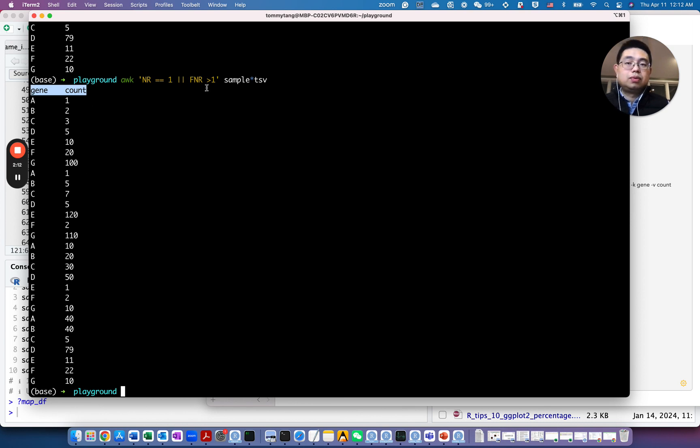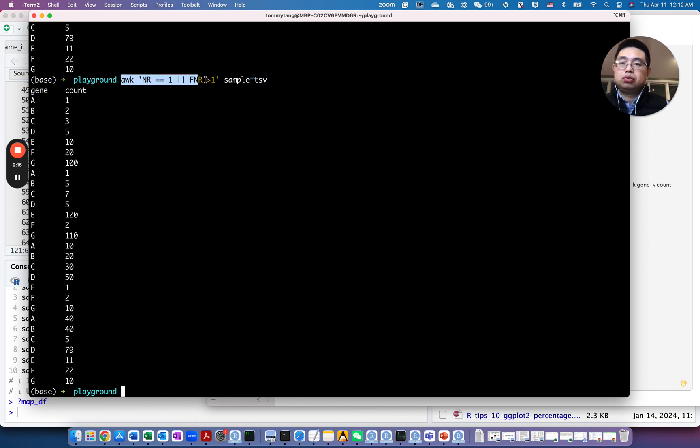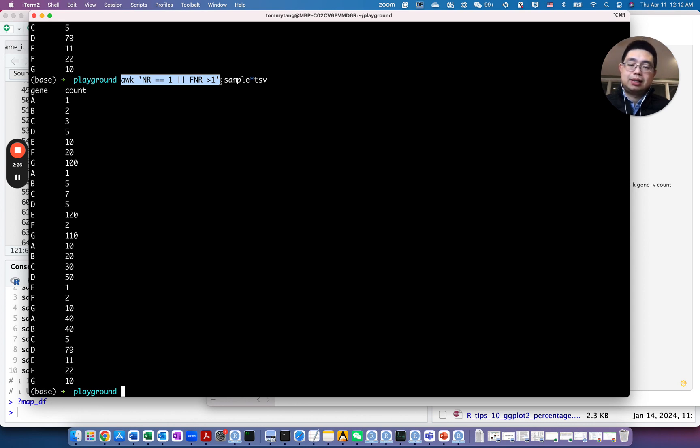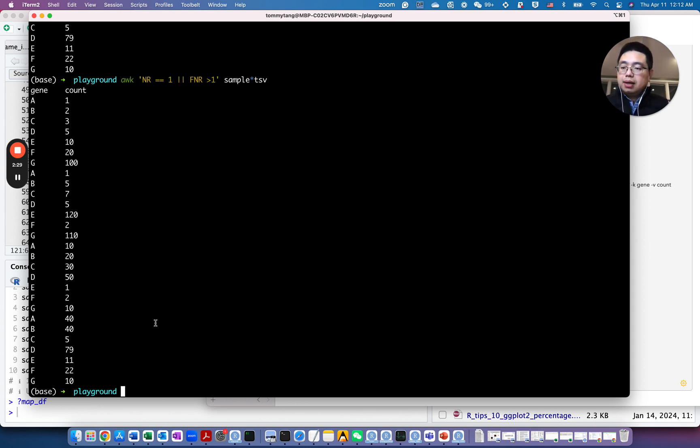So for example, this can be kind of new to you. But what I usually do is Google how to combine multiple files without repeating header, for example, using awk, then you will find this solution.